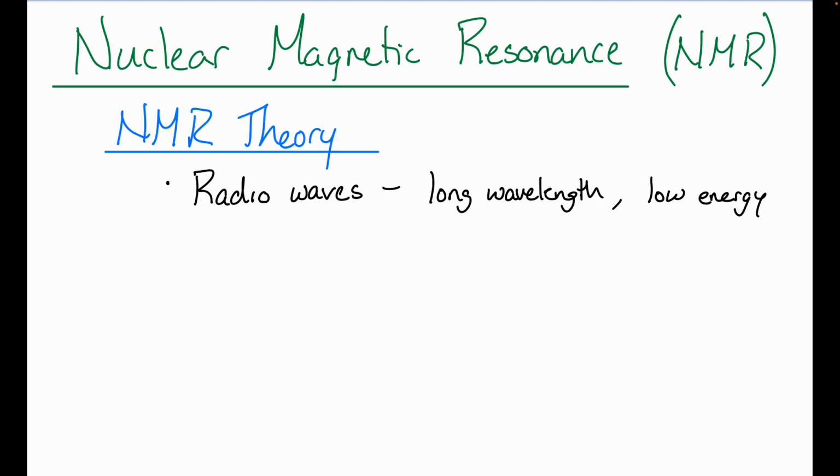Okay, to be honest, the fact this works at all is kind of a miracle. All right. What you're sending in is this very low signal, very low energy radio waves. They're being either absorbed or not by, in this case, what's doing the exciting is our nuclei.